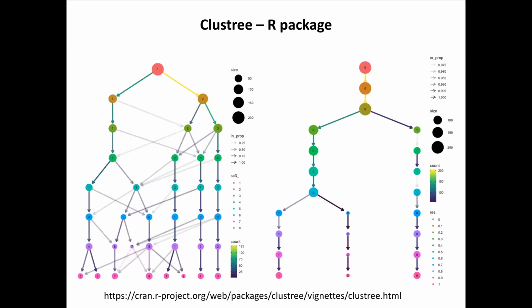I just want to mention also this package, Clustree, that you will see tomorrow when you do the clustering tutorial in the R exercises. It's one way to visualize your clustering. So basically, it will take whatever metadata column you have with different values and plot a tree for you.